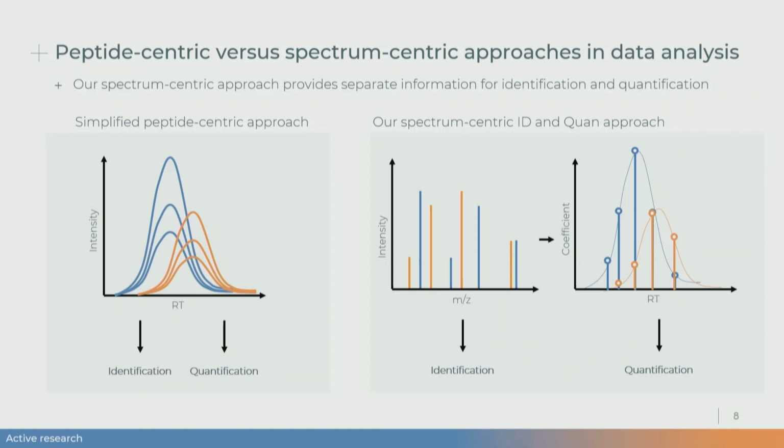We do ID on the currency that we all measure, the spectra, and then we do quantification using these contributions that I've mentioned earlier. On MS1, as currently implemented in Proteome Discoverer, that is done by the Minora feature detector, but in MS2, we can use these contributions that I mentioned earlier, trace them across retention time, calculate the area under the curve, and quantify peptides that way.